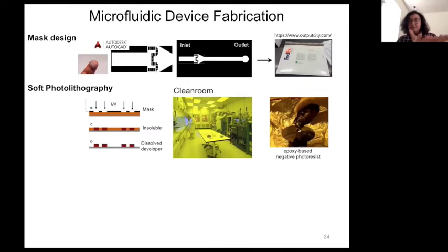Because if we put these materials out and there's UV light or other sources of light, all of your chemicals will be ruined. So you have to have a yellow light just not to expose your samples, because all this is done by UV. So this is the only reason. Does that answer your question? Give me a thumbs up, or I can't see anything, but cool.